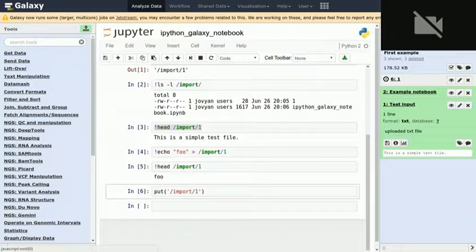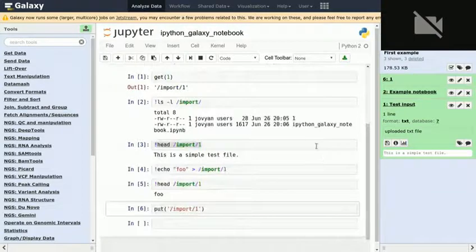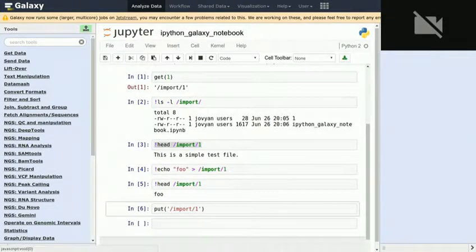Okay, but this only transfers the dataset. So you have manipulated the data, you transfer it back to the history. What you now want to do is also save your awesome code that you have written. Yeah? So this great notebook, science nature application, ready to save. So click on this green button here, and again, you need to refresh your history.